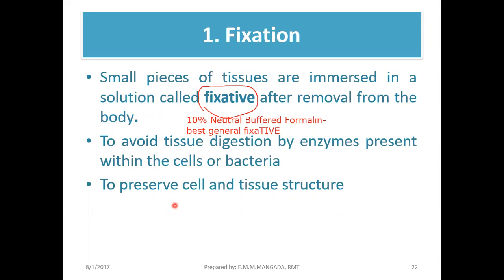Okay, ina-arrest natin. So again, the purpose is to preserve the tissue by avoiding tissue digestion that are actually released kapag namatay yung tissue. There will be release kasi ng mga enzymes dun sa mismong cells natin. And these cells will cause what we call as your self-digestion or autolysis that will lead to yung tinatawag nating agnas. So, pine-prevent natin yon. That's to preserve the cell. Again, the purpose is to preserve the cell in a lifelike manner.